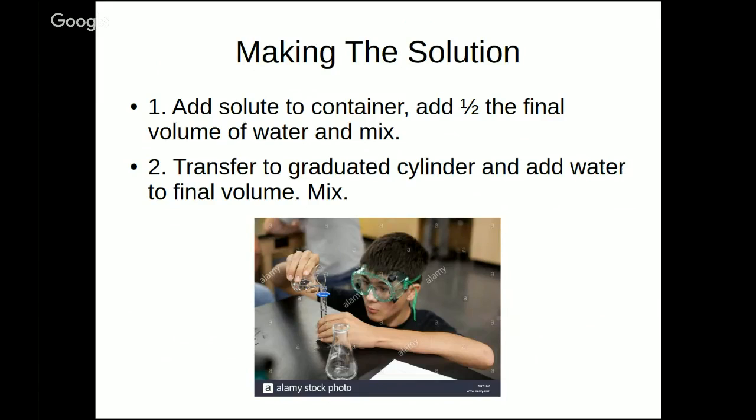Now I've got it kind of mixed up. Next, I'm going to put this solution into a graduated cylinder. I'm going to put the graduated cylinder on a desk, as this kid is doing here. And I'm going to add water to it until it gets up to the final volume. So I'm going to carefully add water to this until it gets up to 200 mL. Then I'm going to mix it again, and I'm done.